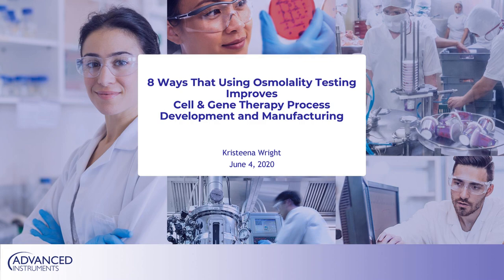So, Christina, what are the goals for the presentation today? So today what I'd really like to do is start to focus our eyes more on the cell and gene therapy space. At Advanced Instruments, and especially within this team, my primary goal is to better understand some of the pain points and really understand the processes that go into building workflows within cell and gene therapy spaces, so that we can figure out ways in which osmolality testing can help fill those gaps, solve some of those pain points, and really improve the process overall.